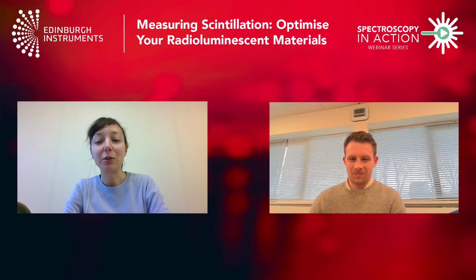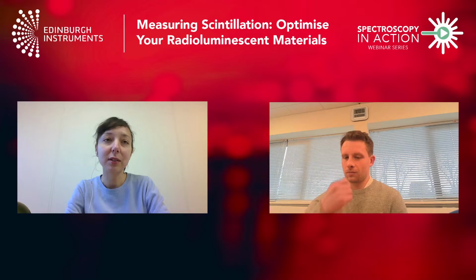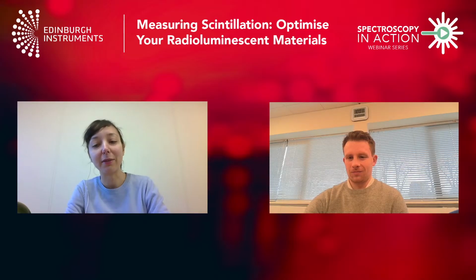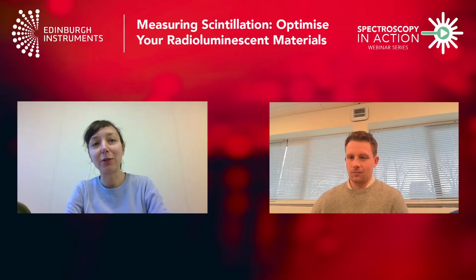Tommy and I are going to deliver today's webinar on measuring scintillation, or how to optimize radioluminescent materials. In this webinar, we are going to give you an introduction to scintillators and their practical applications, and we will discuss how to characterize the radioluminescence from spectral to advanced time-resolved measurements. At the end, we're going to have a Q&A session, so you will get the chance to ask any questions you might have. I will now pass over to Tommy to get started.